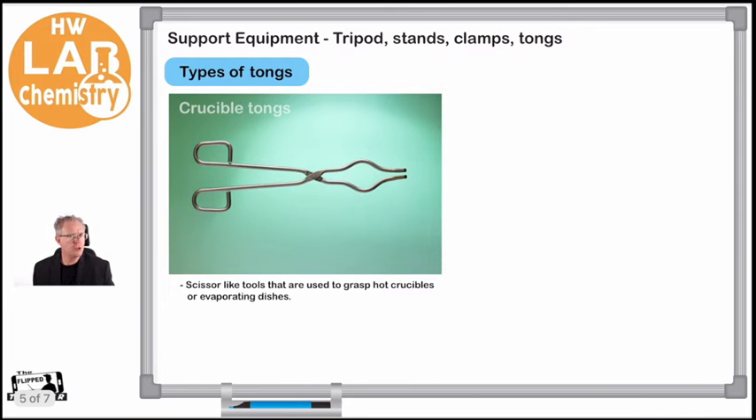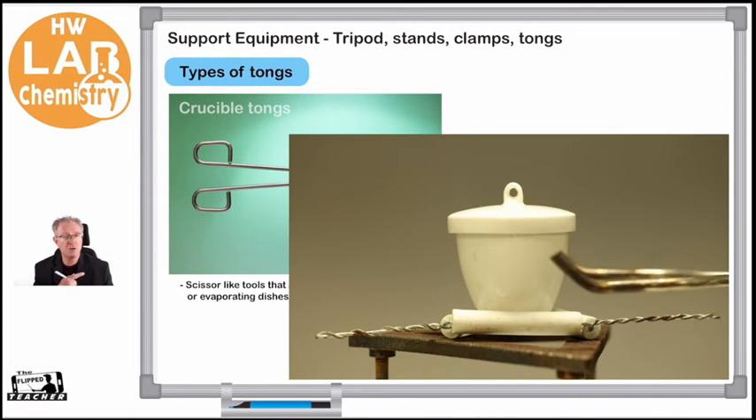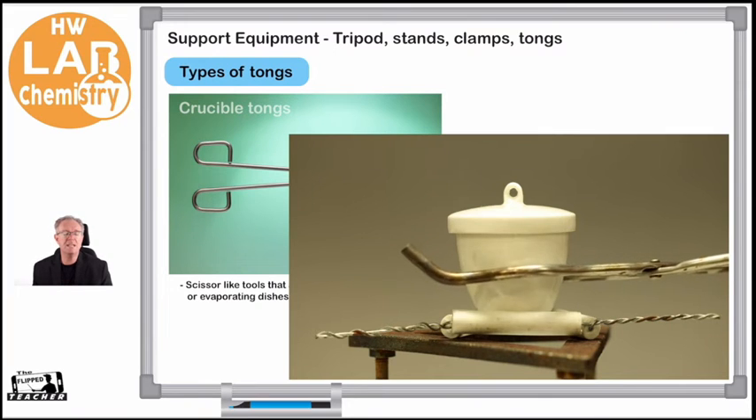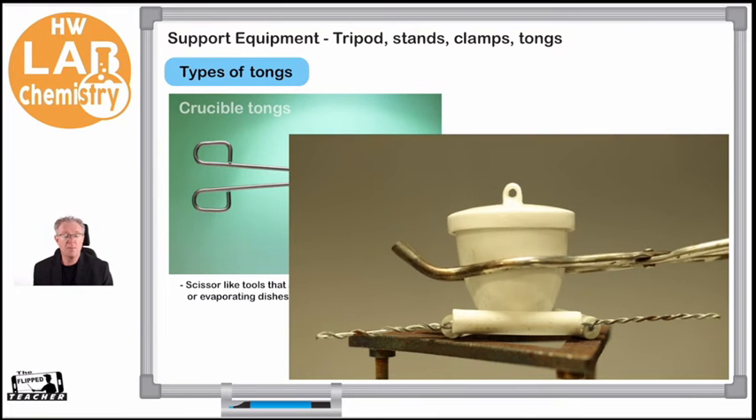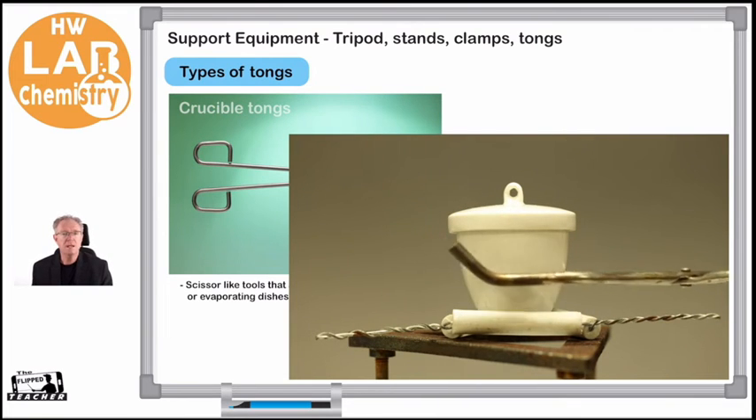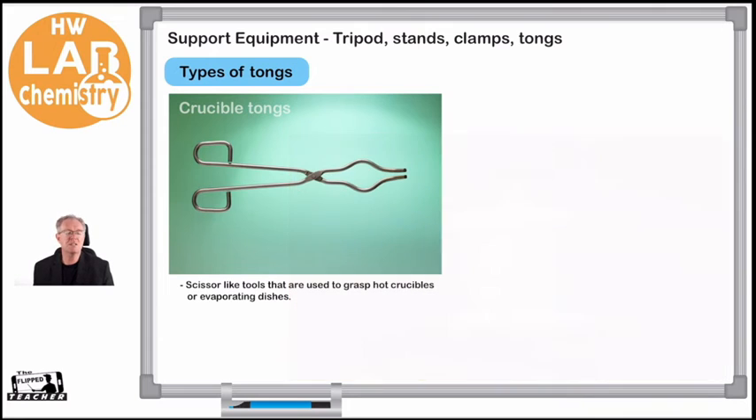Then we have crucible tongs, sometimes called just metal tongs. Crucible tongs are specifically designed to hold a crucible. A crucible is a ceramic device that we use to heat solids. To pick a crucible up and place it on the tripod with a pipe clay triangle, and to move it around, we need a specific shape to our metal tong. You can see that the metal tongs are shaped so they can move around the crucible and pick it up and put it down.